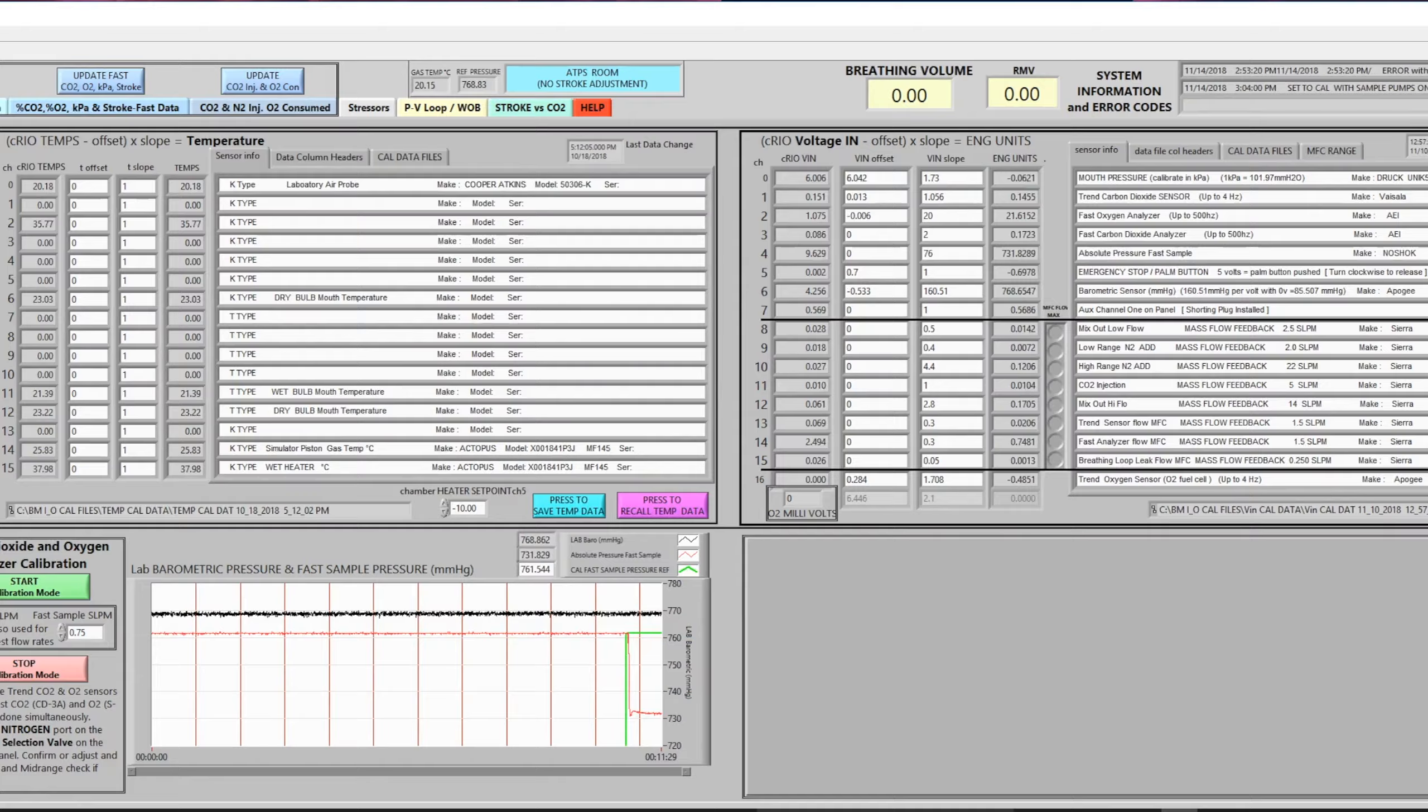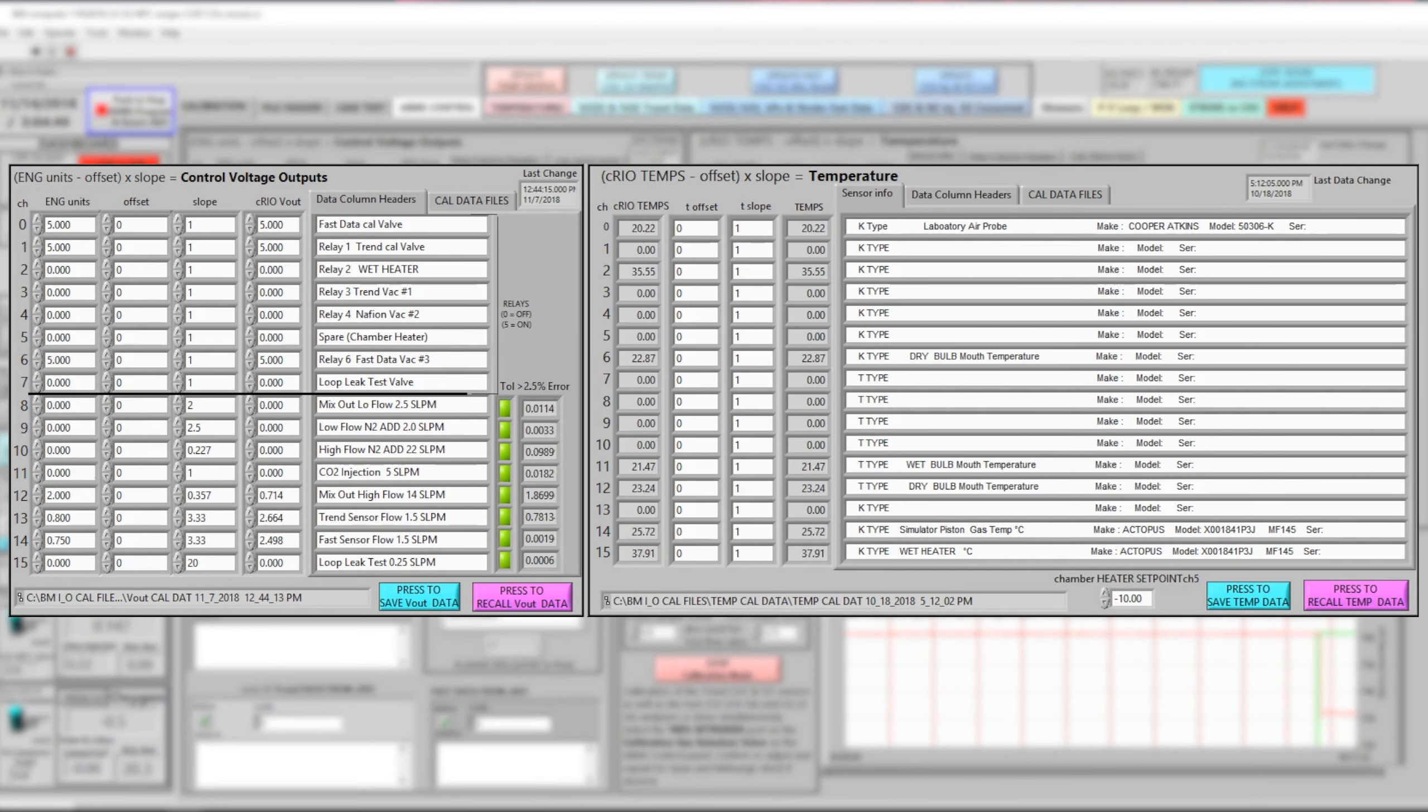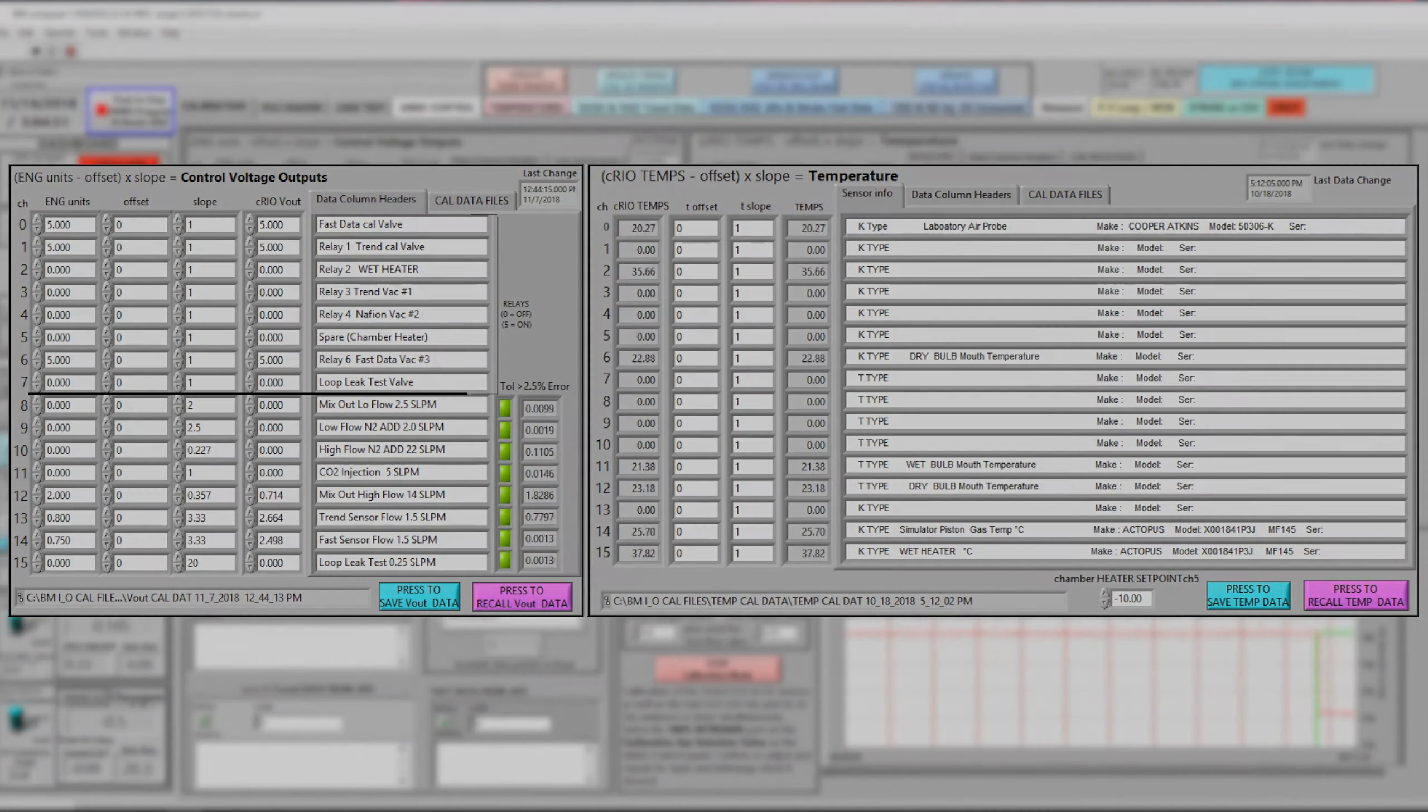On the left monitor here are the control voltage outputs and all of the temperature inputs.